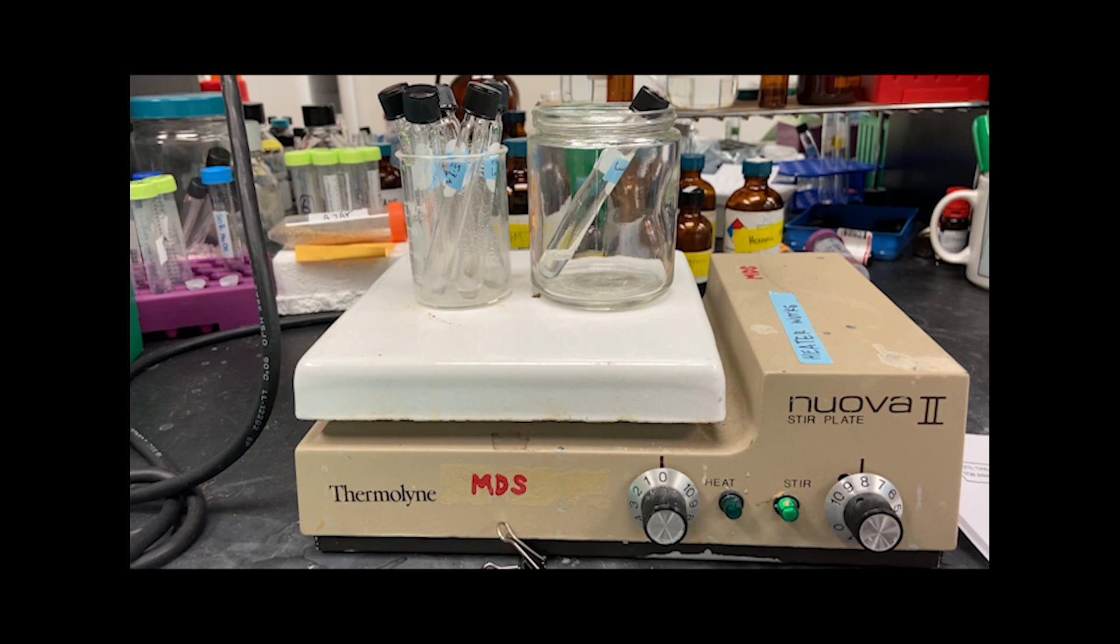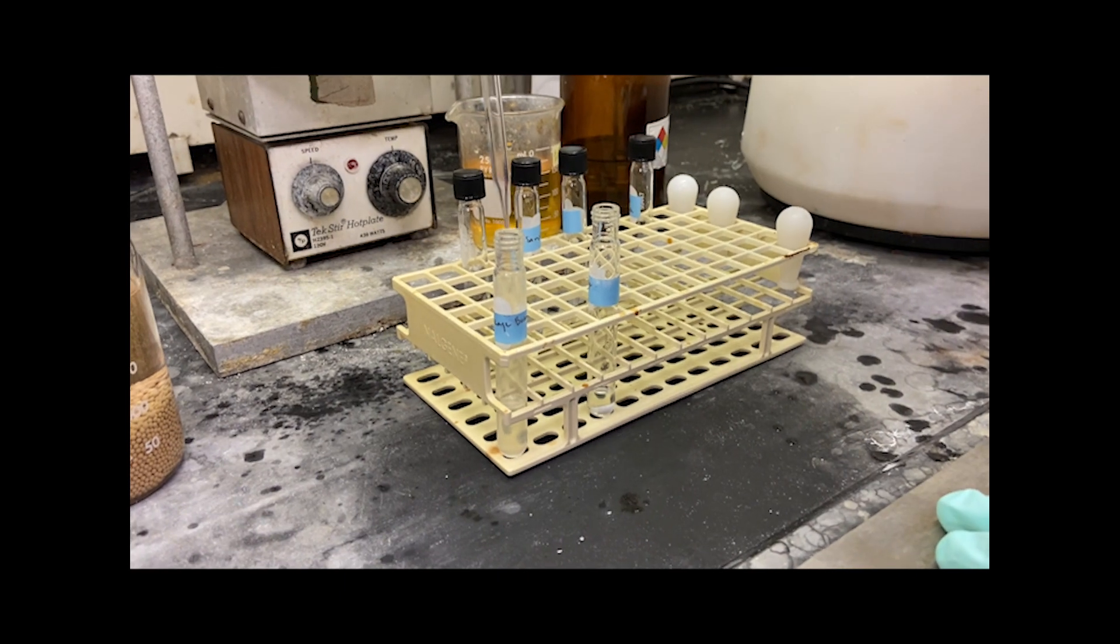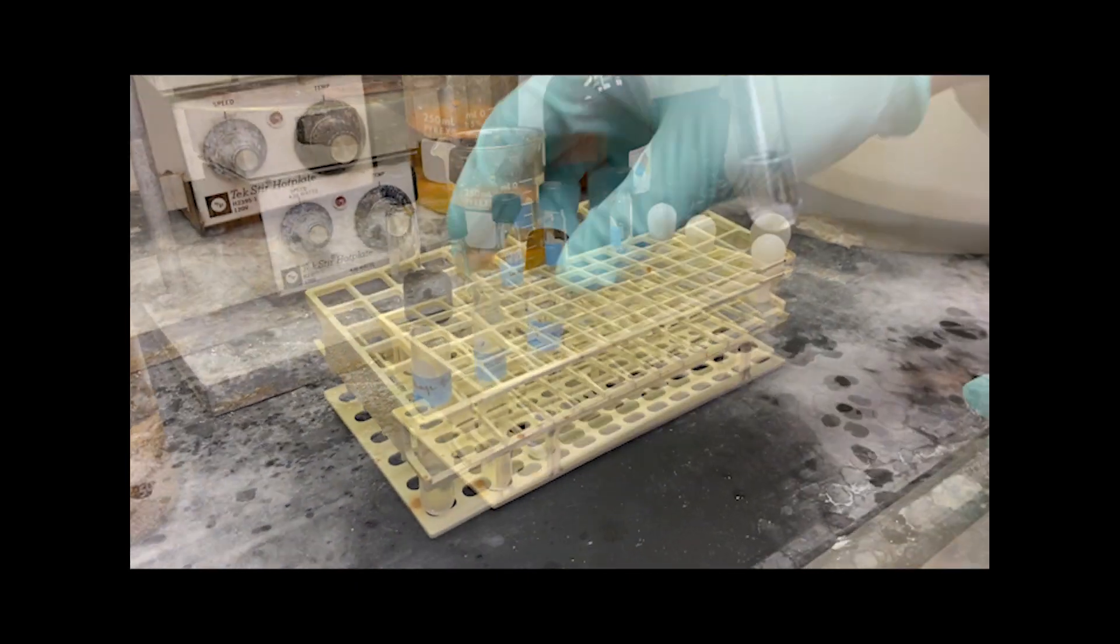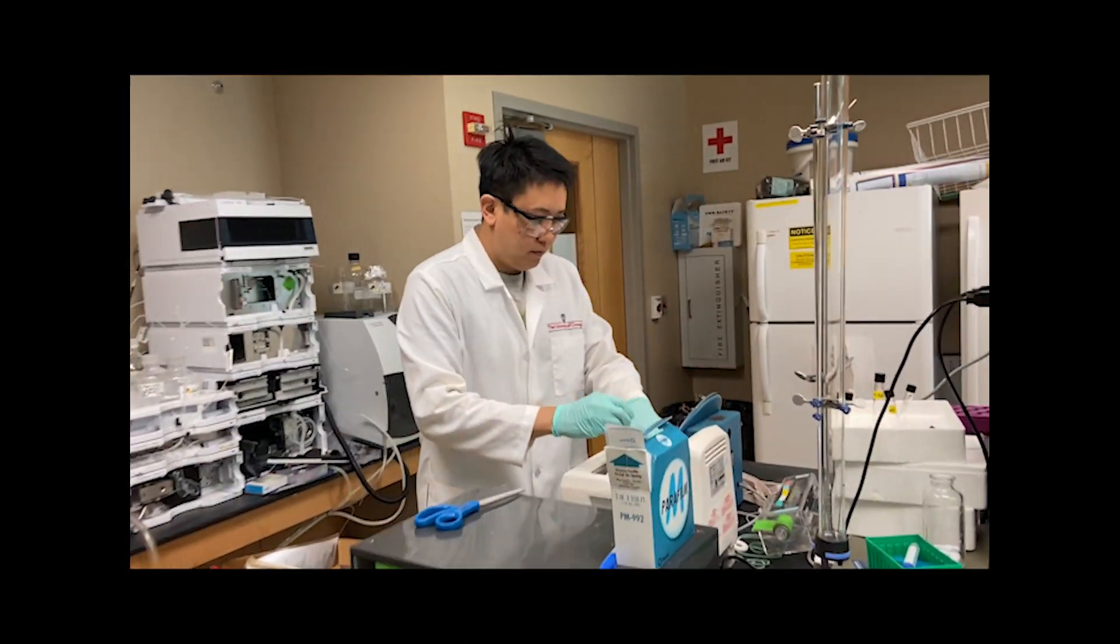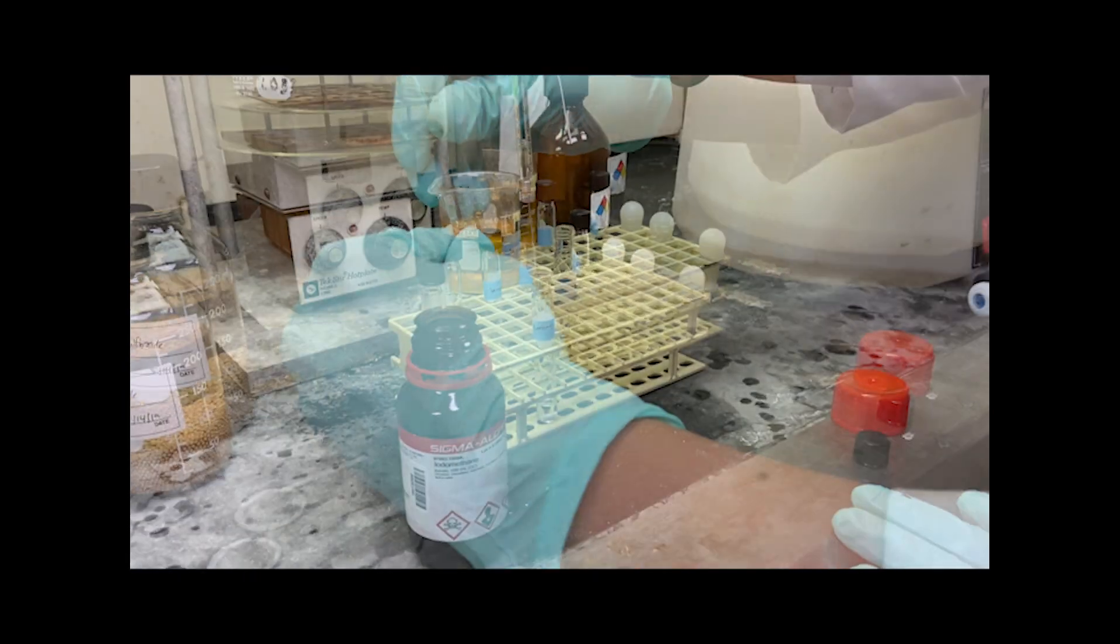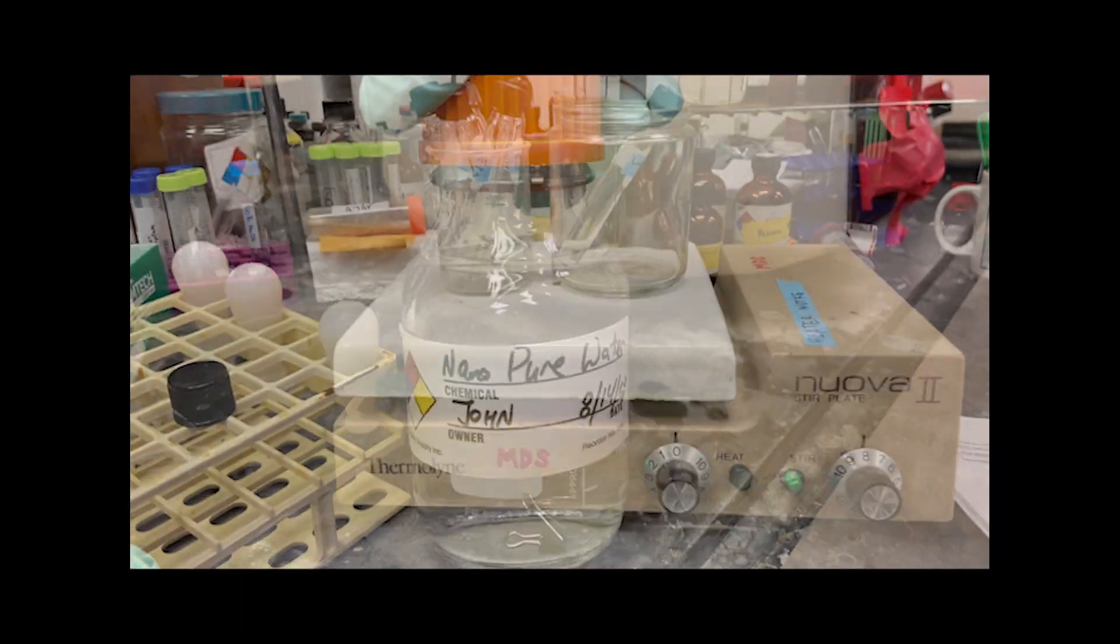To try to ensure complete methylation, a second round of base and iodomethane addition is effected. A second methylation is not necessary in some cases, such as oligosaccharides. 400 microliters of our base is added again and allowed to sonicate for 30 minutes, followed by another 100 microliter addition of iodomethane and a 40 minute spin.